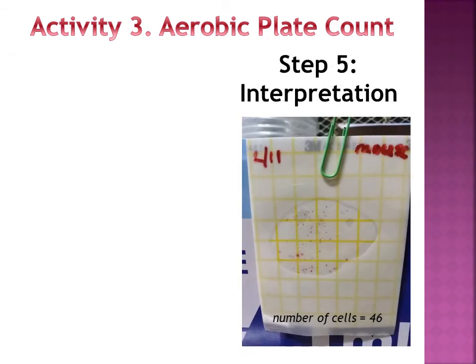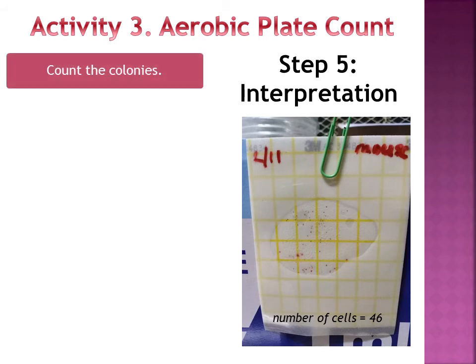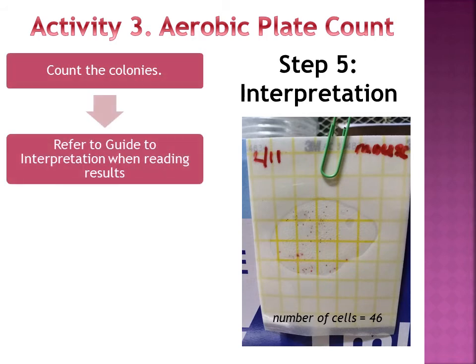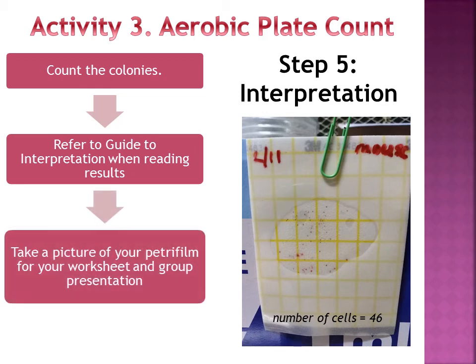For your data, count the colonies. Refer to the guide to interpretation when reading results. Take a picture of your petrifilm for your worksheet and group presentation. For this sample petrifilm, there are 46 colonies.